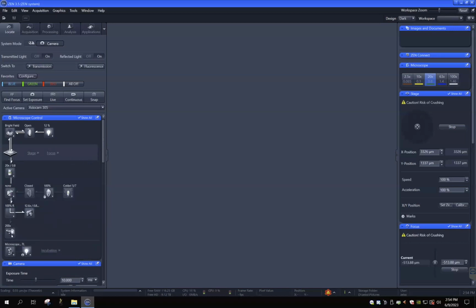And then it's going through here. You can decide whether you want this to go through the objective so that you can observe the image by your eyes, or you want to use the camera to see it. Like you can see the path is changing here. And on the right hand here, these are for the fluorescence use. So we're gonna skip it for now.